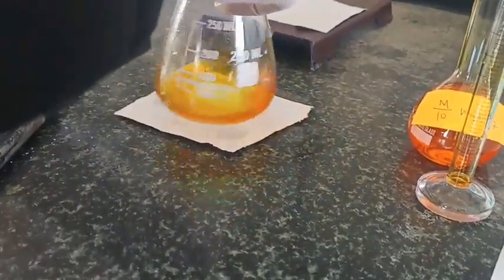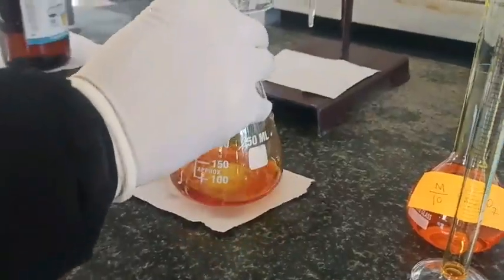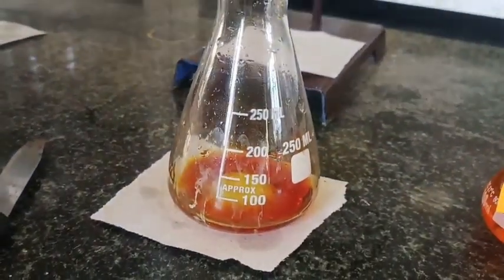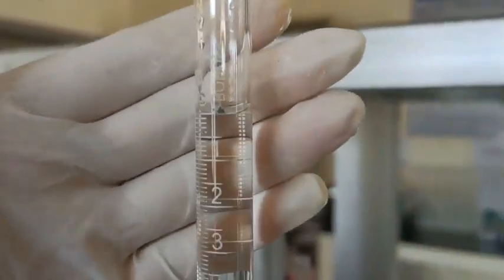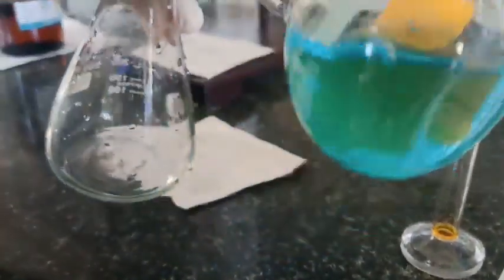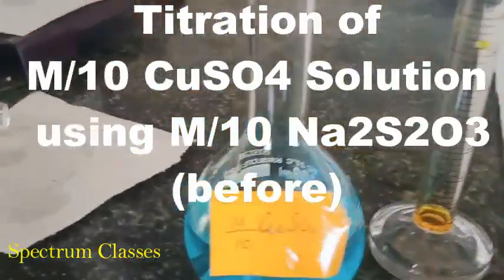I leave it after covering it for 2-3 minutes so that iodine is released. Here you can see the mark, and I am going to titrate it. Near the endpoint we use the starch solution, when the color of this solution has faded. Now we are going to titrate our copper sulfate solution.